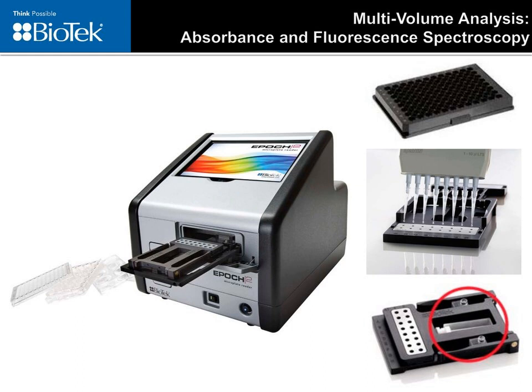I'd like to start with a brief introduction to multi-mode analysis and detection methods available for use with a microplate reader for those of you who may not be familiar with microplate technologies. Microplate technologies are most well known for the ability to perform a variety of assays in a high-density microplate format to allow increased sample throughput.